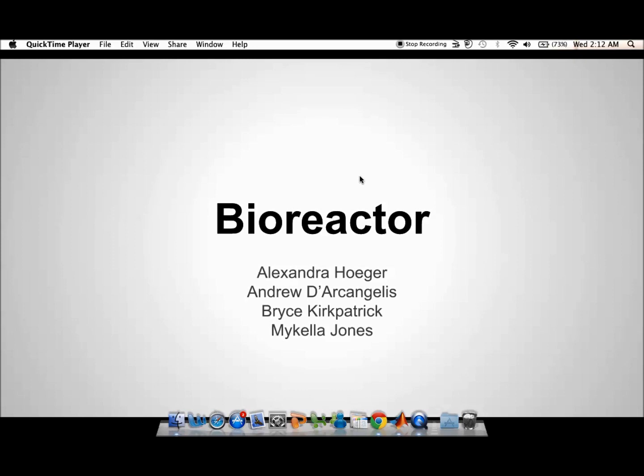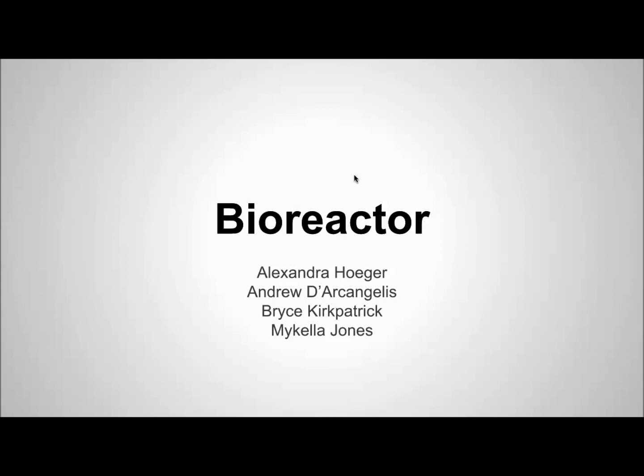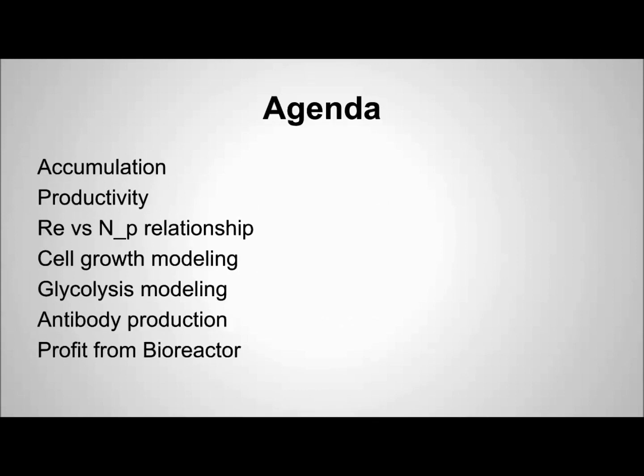Next, we're going to give you a brief overview of our agenda. We're going to start off with looking at our accumulation, move on to productivity, Reynolds number versus power number relationship, cell growth modeling, glycolysis modeling, antibody production, and finally the profit of our bioreactor.